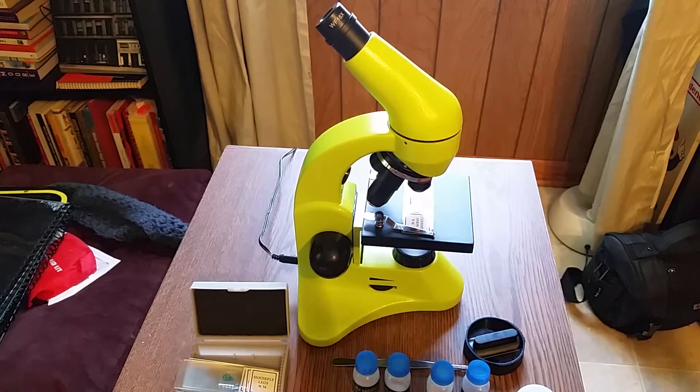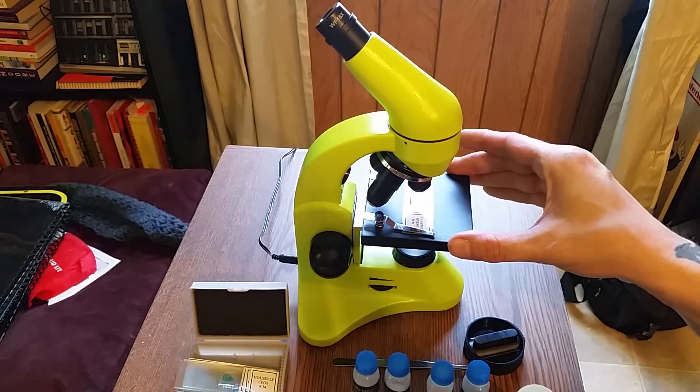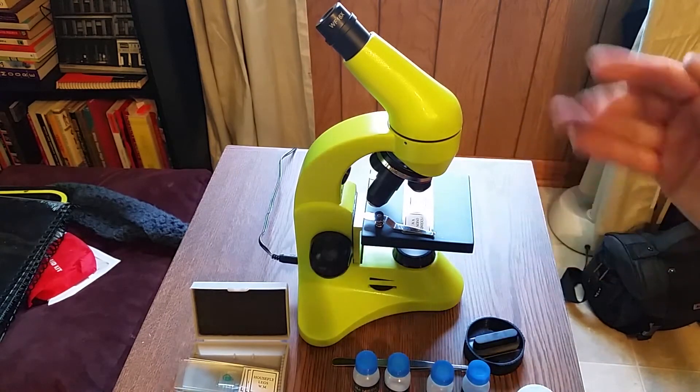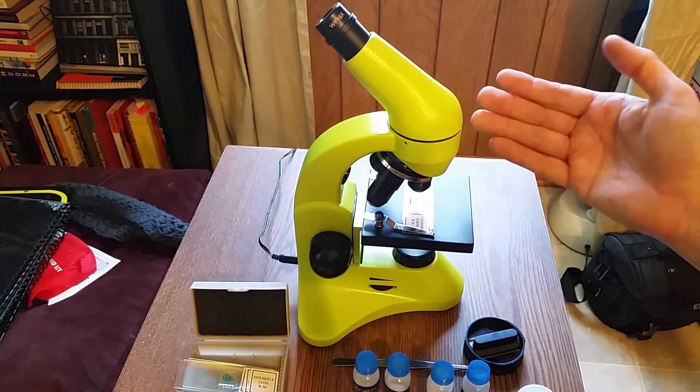I think it would be fun for every level of experimentation — whether you're being introduced to science, doing projects, or an intermediate user. But having said that, this 50L Plus model is still pretty good. I really like it and I've had a lot of fun with it. When looking at what it comes with, you have the microscope itself and your objectives.